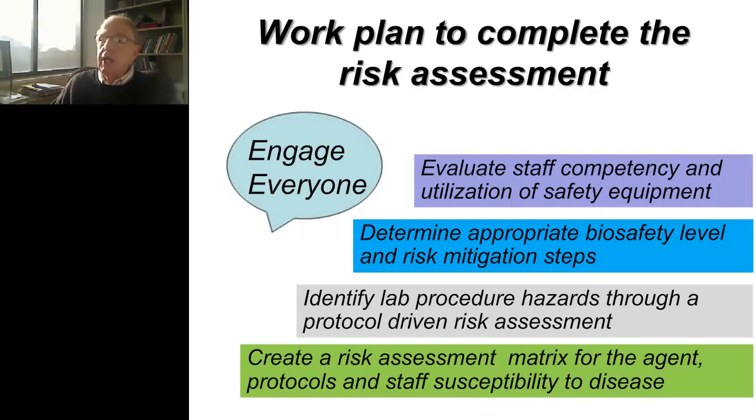As part of your biosafety plan, it's really important to evaluate staff competency in utilization of safety equipment. We all know that after the Ebola crisis, one of the things that we identified that came out of it is that people are not well trained in putting on PPE and taking off PPE, the donning and doffing processes.